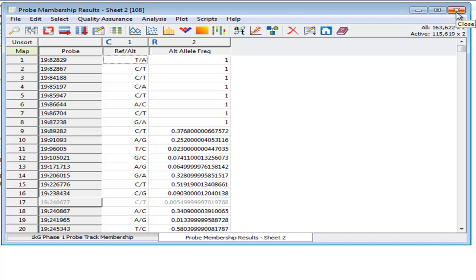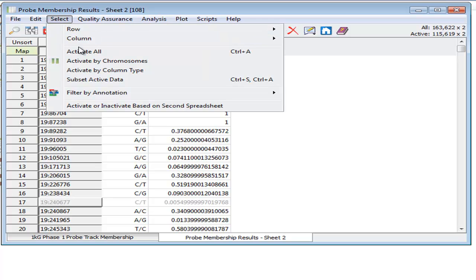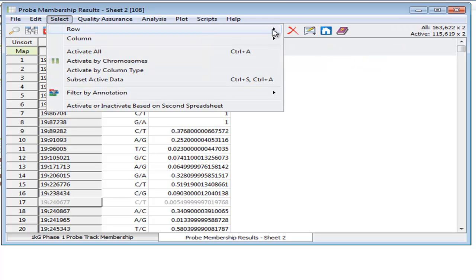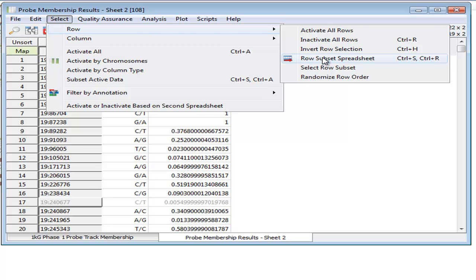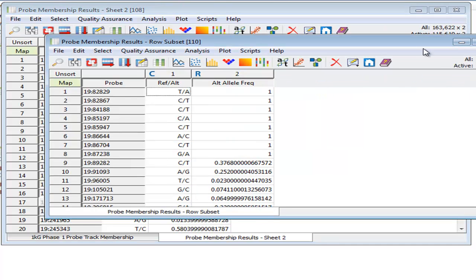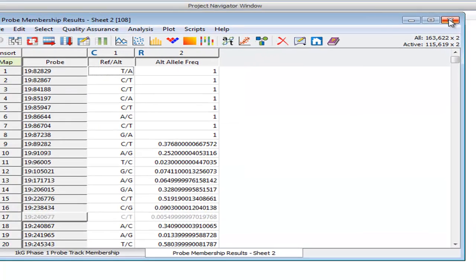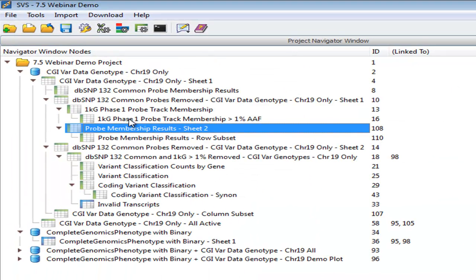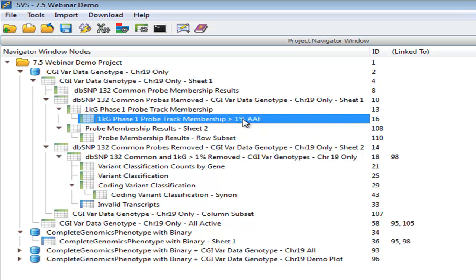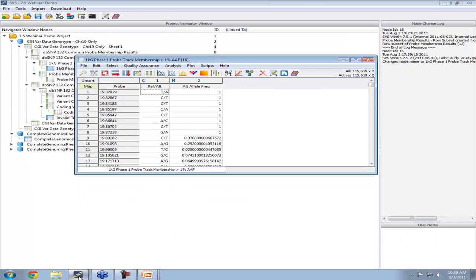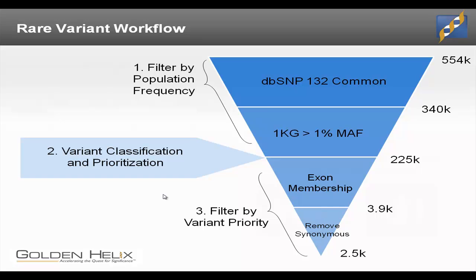So from here, we can choose to create a list of only these 115,000 common variants, again, by going to select row, and this time we'll do a row subset spreadsheet. Now this spreadsheet contains only these 115,000. And I've already done this and named this the 1000 Genomes Phase 1 ProbeTrack Membership greater than 1%, and we'll use that to do more filtering. So going back to where we're at in our presentation, we filter down by this population information. We've gotten down to 225,000 markers.